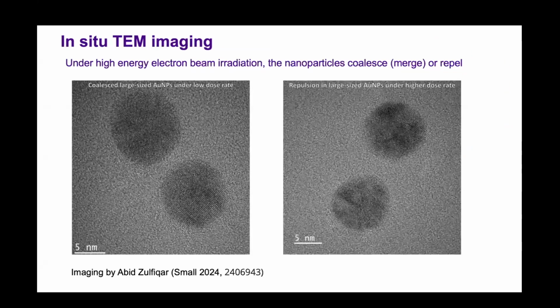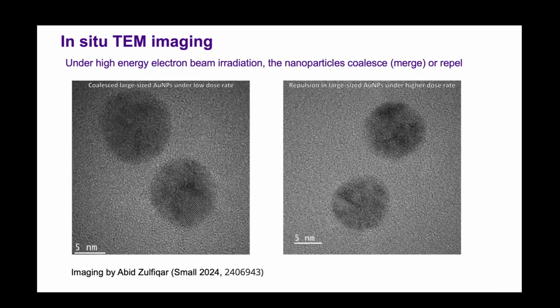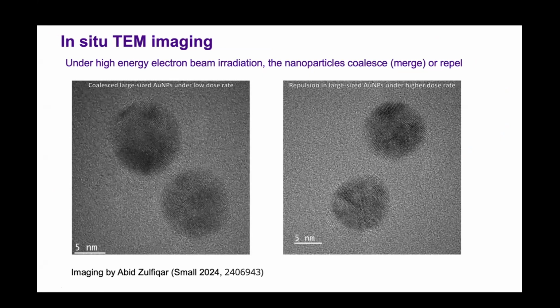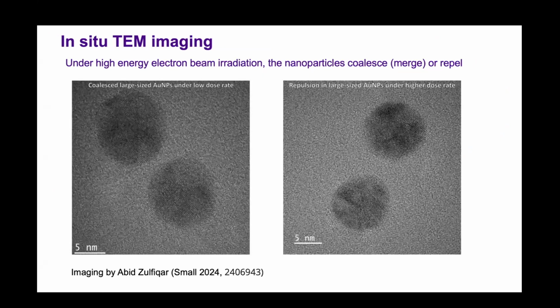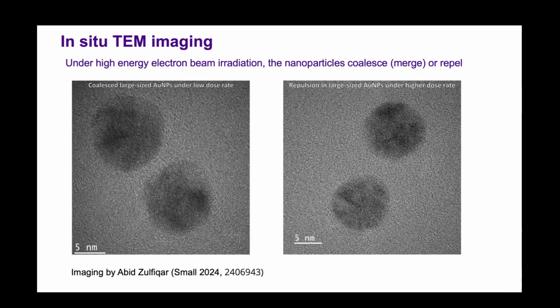So then what else? Can we visualize particles? Here I am showing one of the studies done also here by our PhD student Abbe recently. These are the 2 nanoparticles. We irradiate with the electron beam, and they are, let's say, a few nanometer in distance between them. And this image is taken for 1 hour continuously. I have fast forwarded it by almost 60 times.